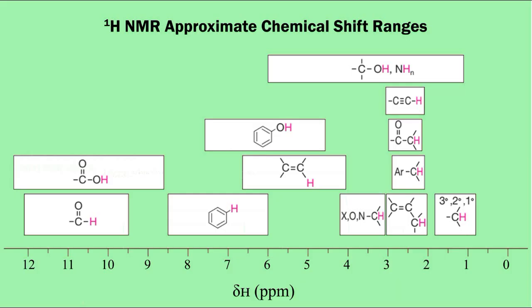The first concept is the chemical shift, which tells us about the electron density surrounding a proton. It's measured in parts per million, or ppm, and can give insights into the types of atoms nearby. For example, a proton near an electronegative atom, like oxygen, will appear at a higher ppm.